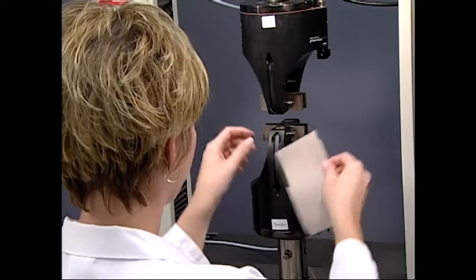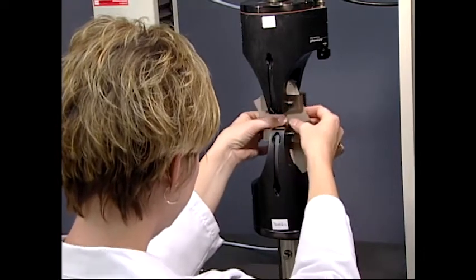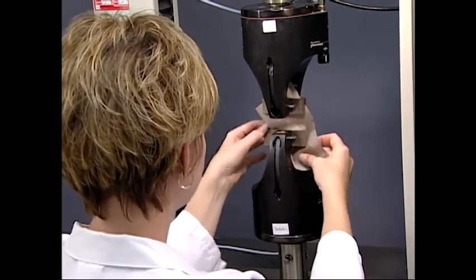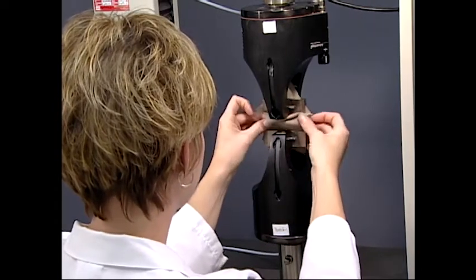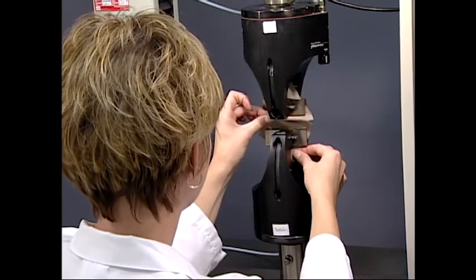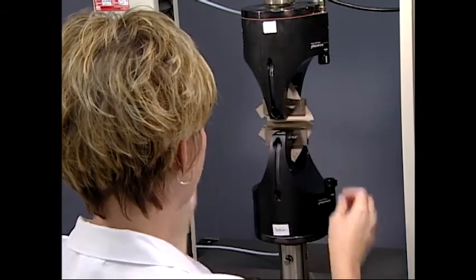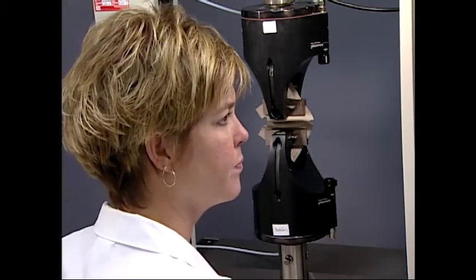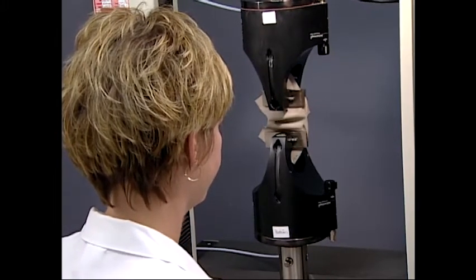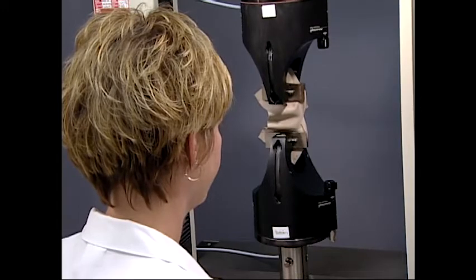The measurement of tearing strength, as measured in this test method, requires that a small initial tear be made before the apparatus for tearing is activated. The final reported value obtained is not a measure of the force required to initiate the tear. The long direction of the sample is the direction of the test. For example, if the long direction represents the warp, then the force is directed across the warp.